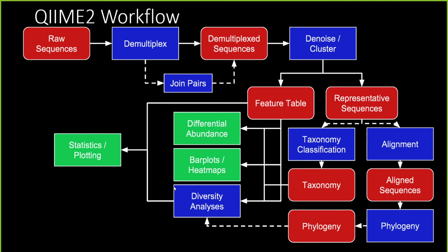So I'll just get started. This is from the tutorials overview page, and this is getting oriented to the flowcharts. I edited this a bit to make it more conducive to my computer.